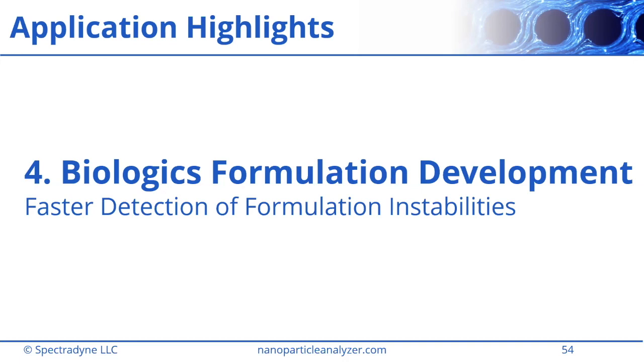This is a very long process, and many times the stress period can be for days or weeks on a shelf or something like that. And so people working in this area really want faster methods to be able to assess the instabilities of a formulation.